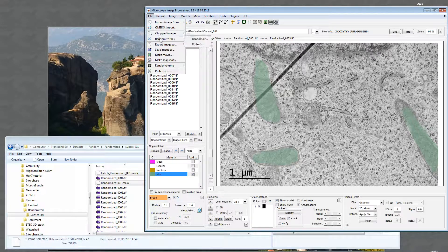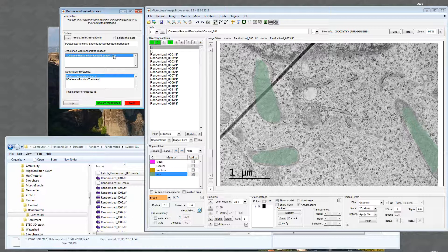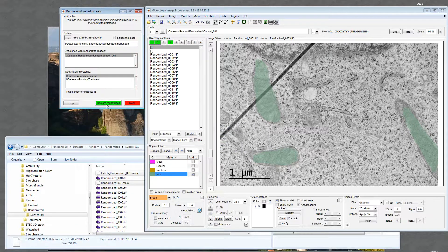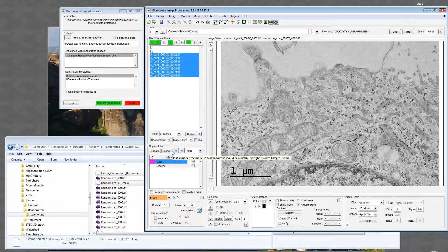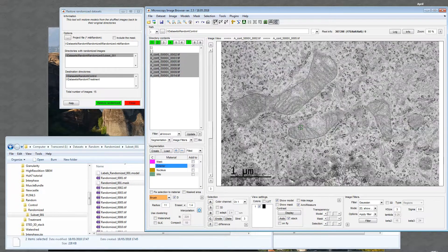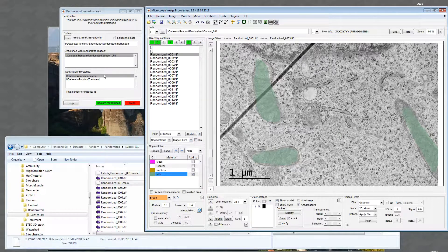Then I go back and restore. I select the project file, take the images from subset one and place them back in control and treatment. If the directory path has shifted, it's possible to update it using right-click > Update Directory. After restoring, I load the control cell, load the new model I just exported, and I can see the three extra mitochondria were successfully segmented and transferred. This is the way to work blindly with your data in order not to get biased by knowing which dataset you're working with at a particular moment.